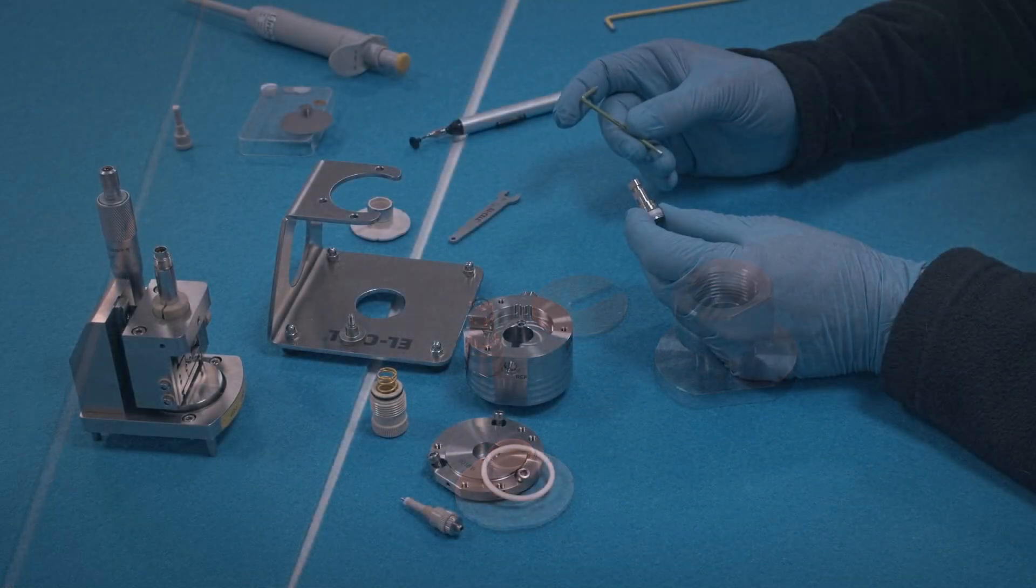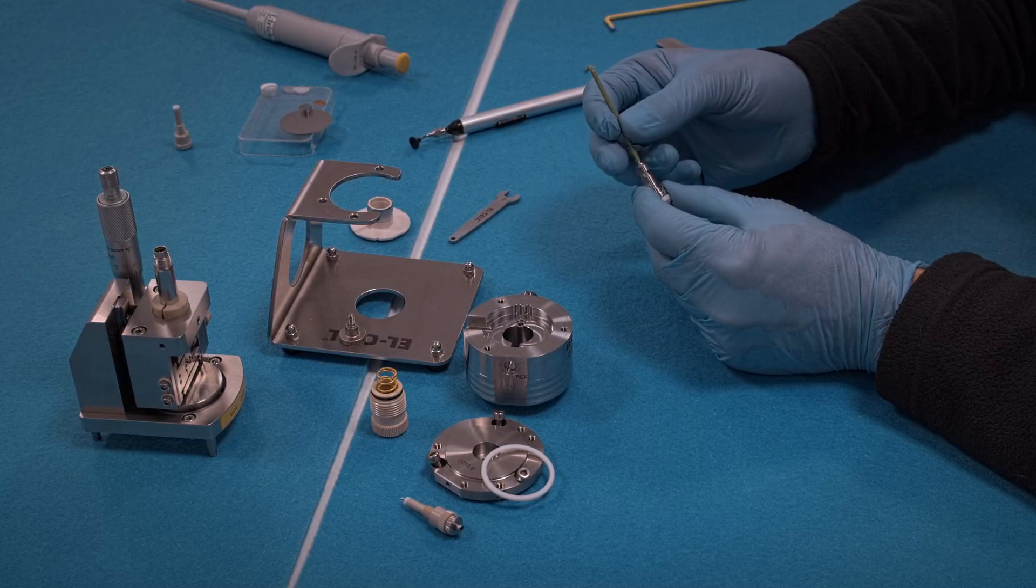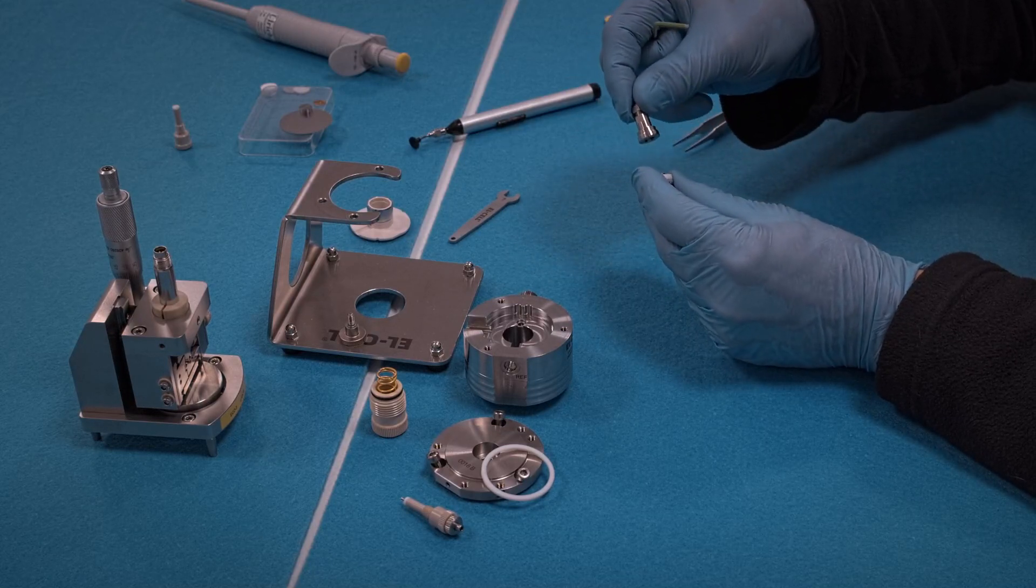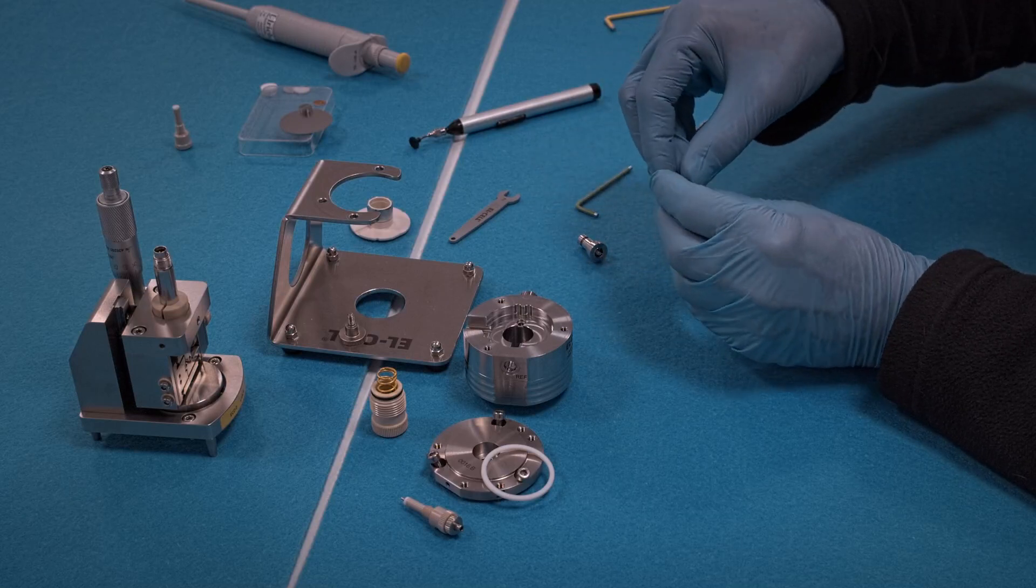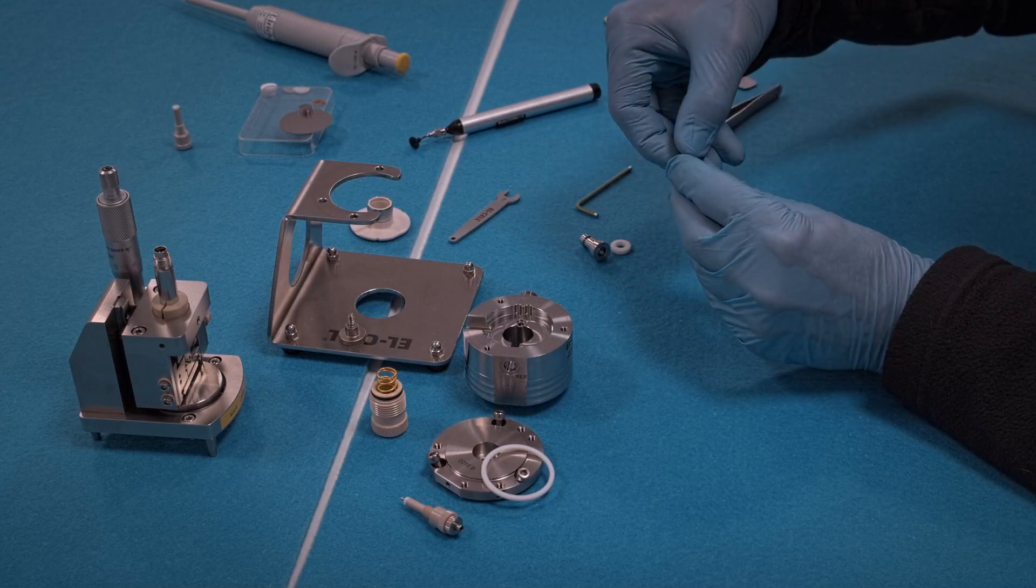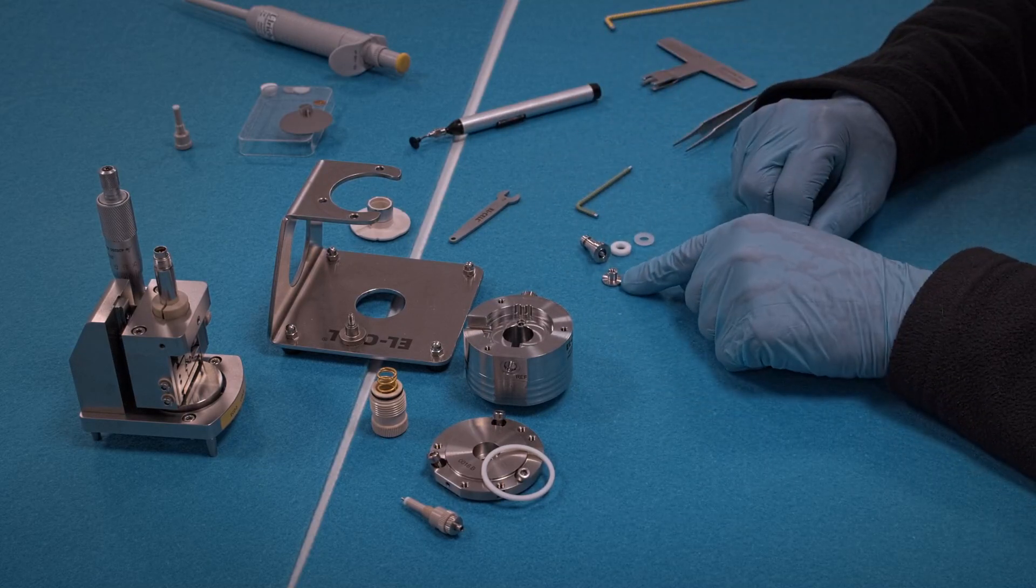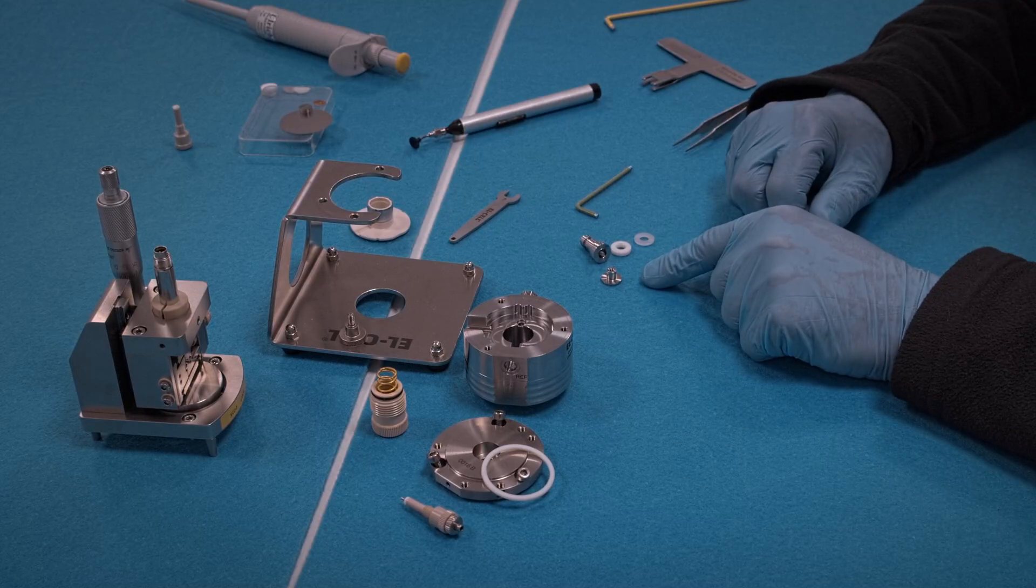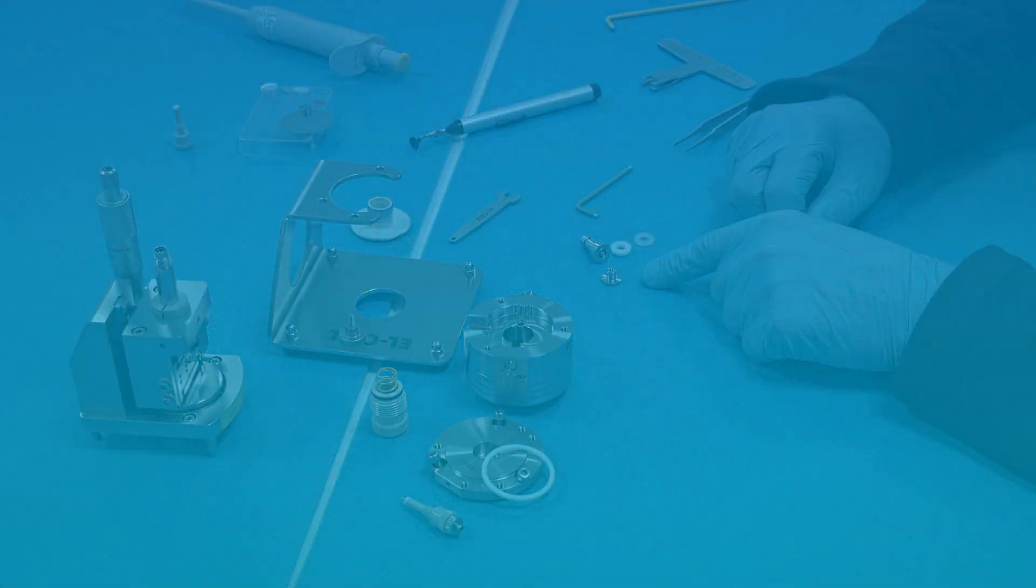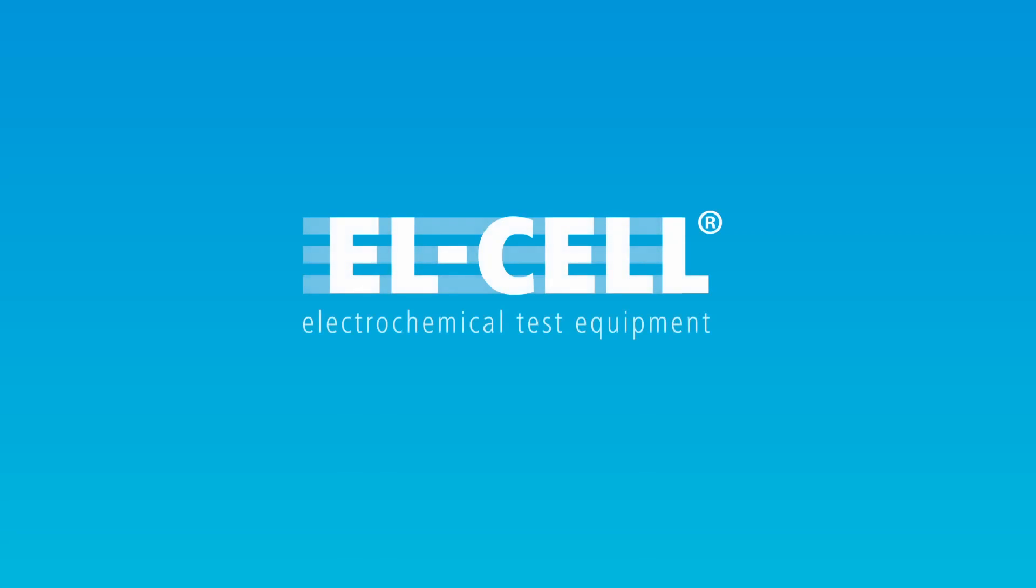And only now further disassemble the piston. The two seals are disposed. You have to use new seals for each experiment. The two metal parts are cleaned, dried, and reused. Okay, and done. All right. Thank you.